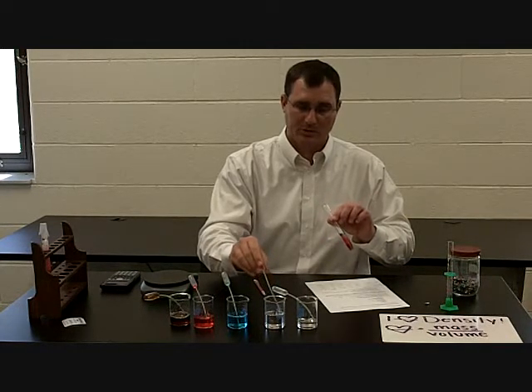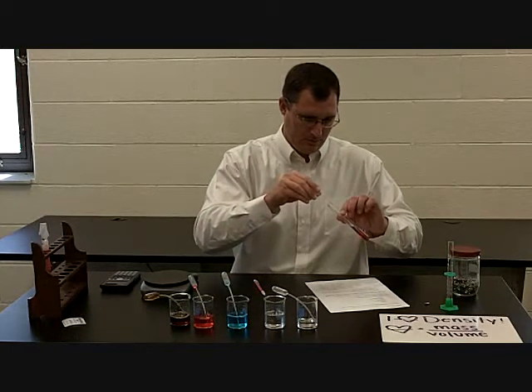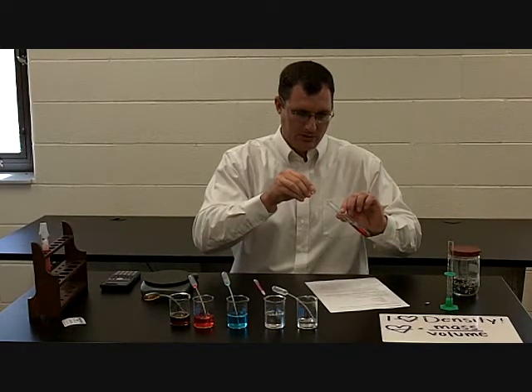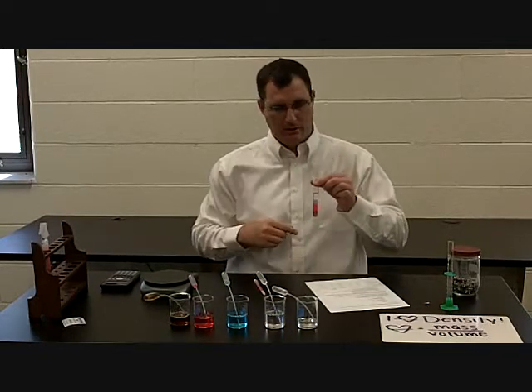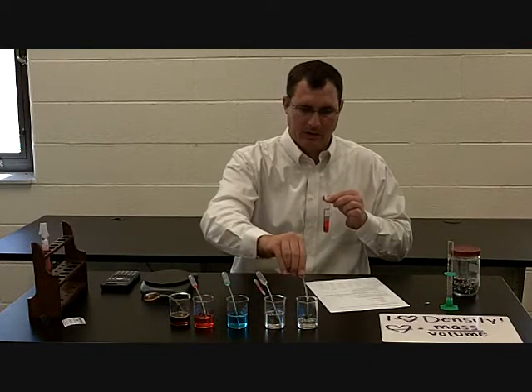And for mineral oil, we're just using baby oil. That's all it is. Okay, let me put it on here. Again, I'm doing it easy, so I'm trying not to disturb my layers. And I've got nice four distinct layers. And my last one is the isopropyl alcohol.